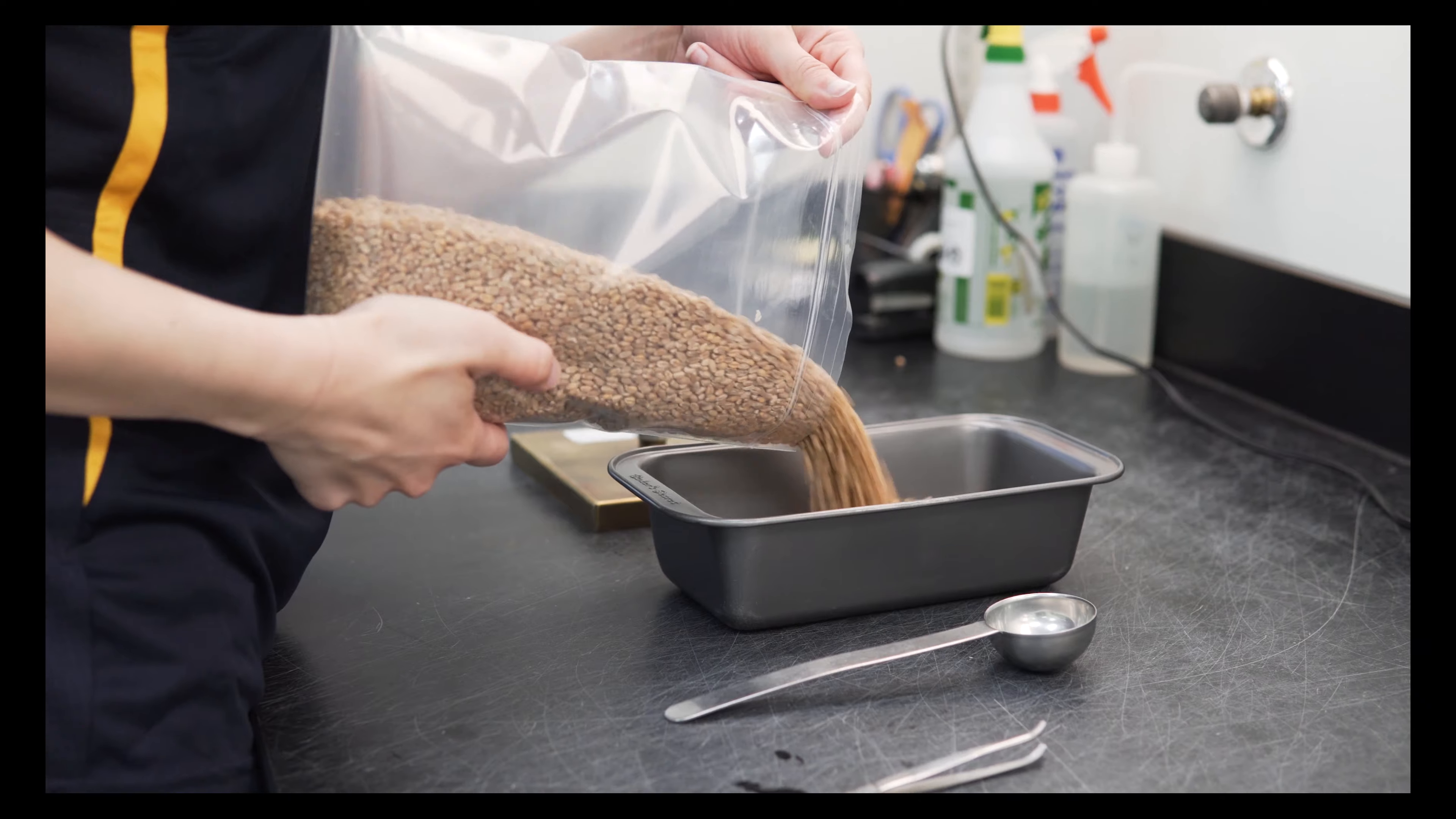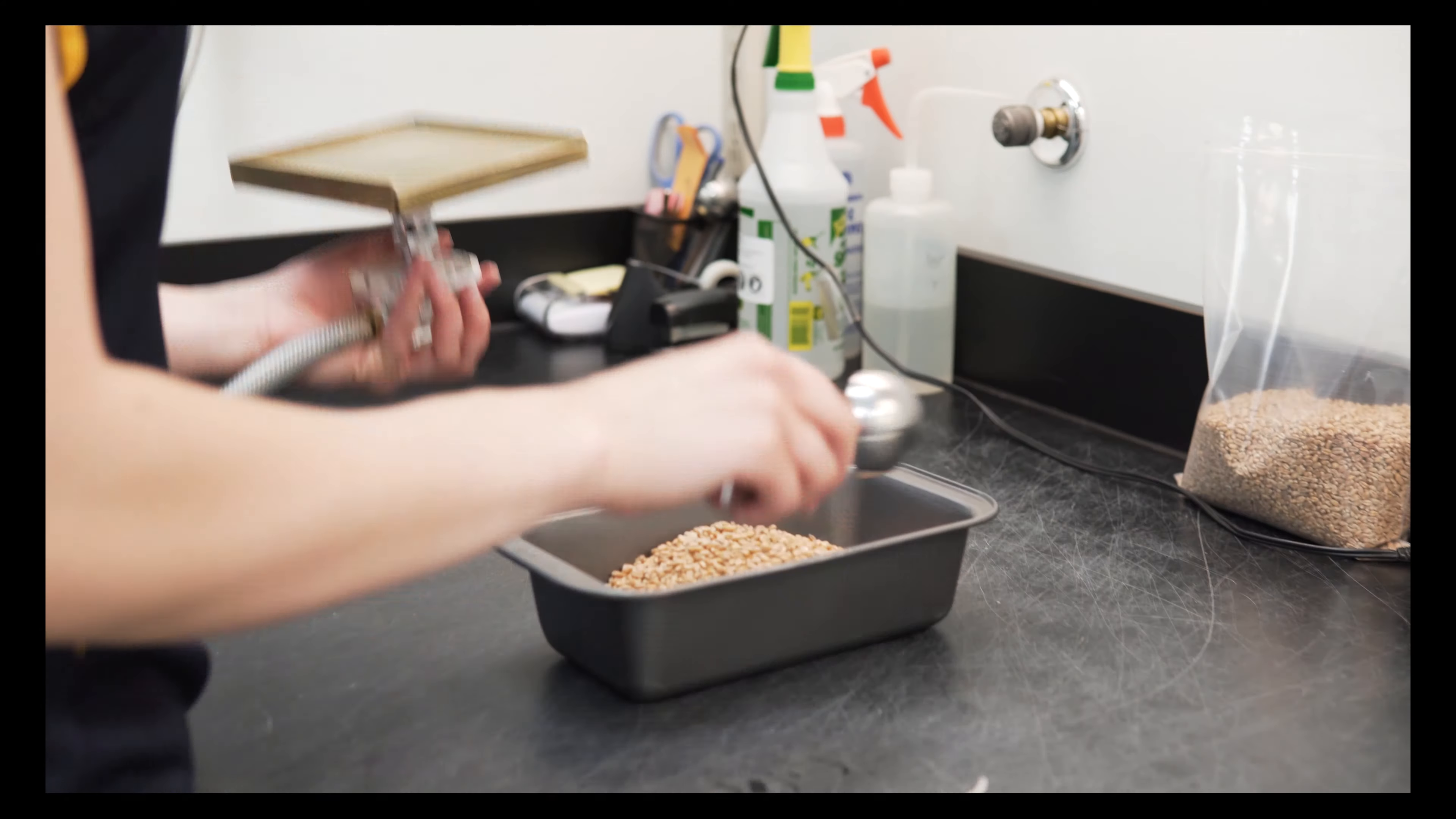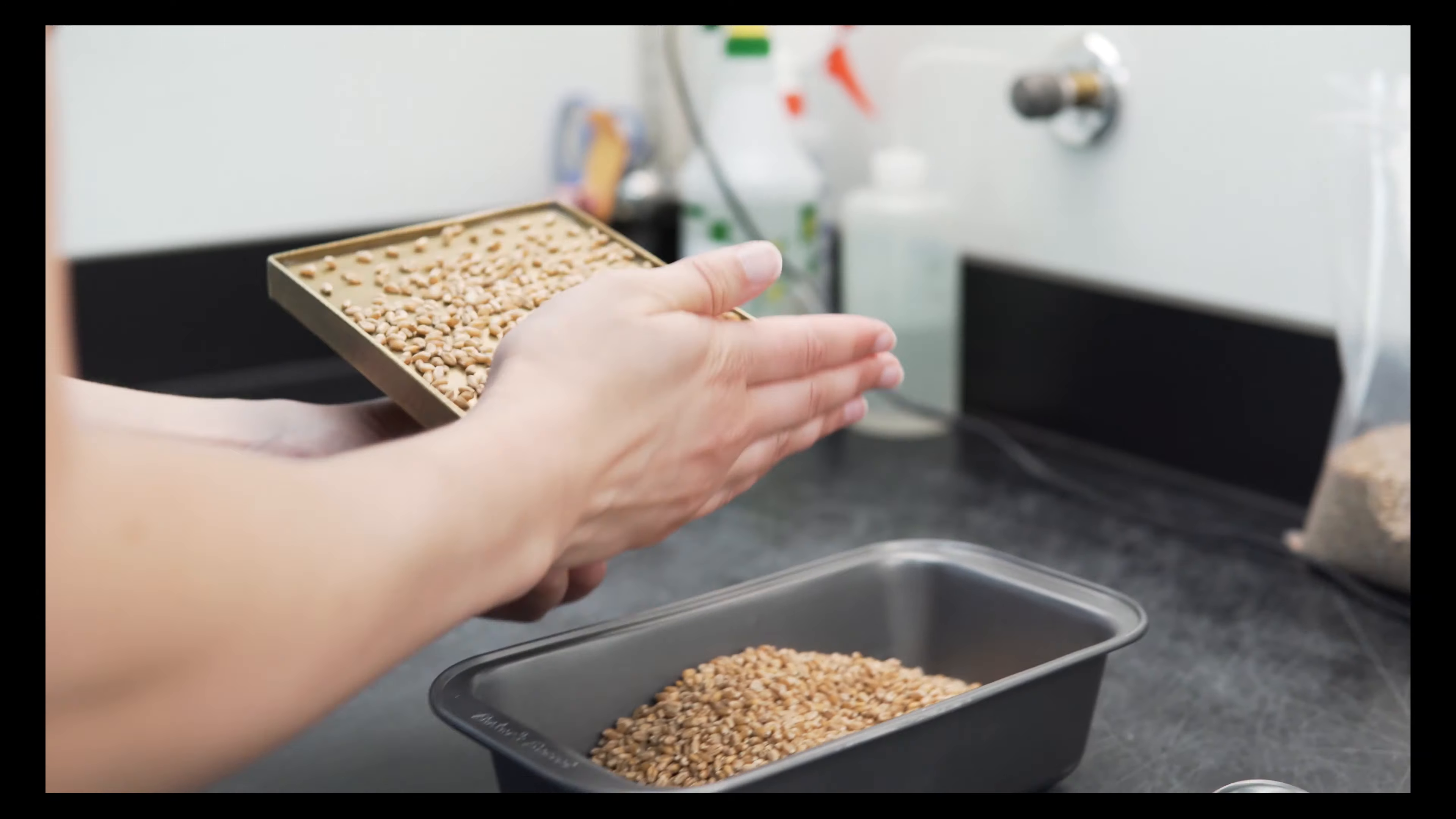Testing your seed for germination is the first step in determining seed quality. The ability for seed to germinate is key to finding out the planting value which leads to plant establishment.